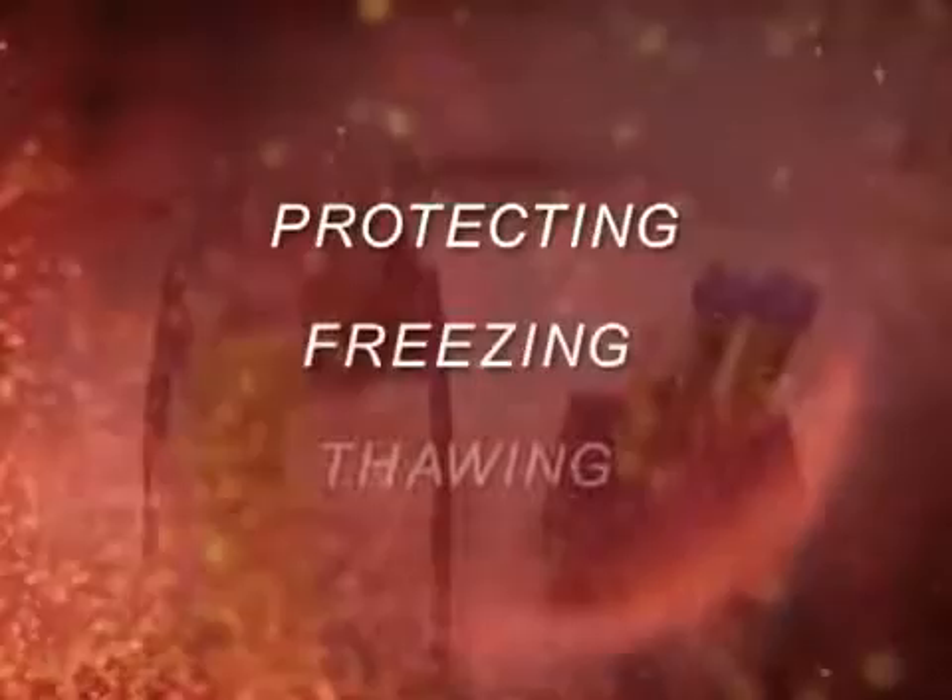Droplet freezing can be divided into three main stages: protecting, freezing, and thawing.